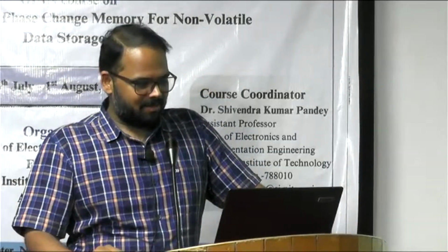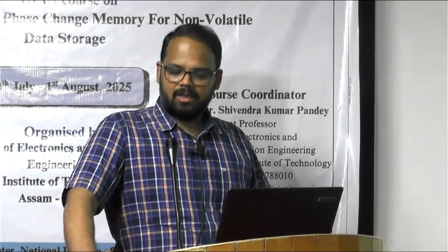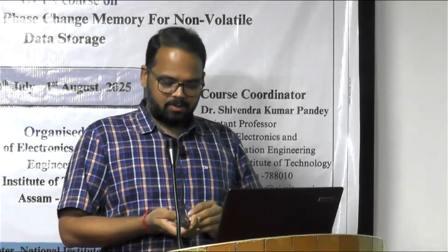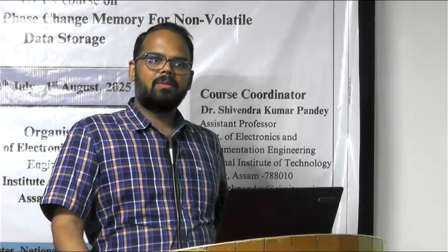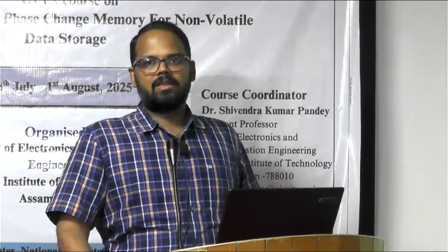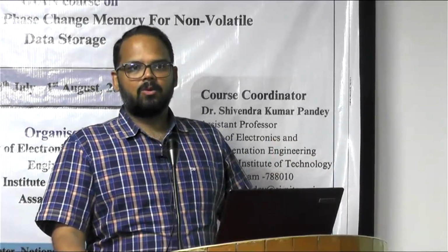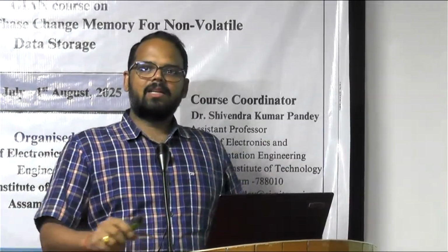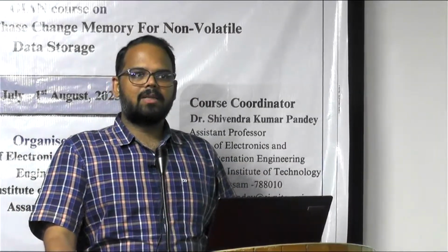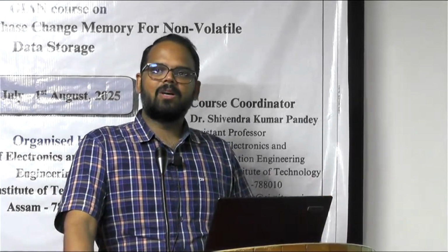So now we will go ahead with our next session. This is based on tutorial. In this tutorial, we are going to discuss thin film deposition, how you can make a thin film. First of all, what are the equipment currently which we have here. On that you can see that facility and how we can make the thin film based on these chalcogenide based devices. And if we want to take their resistivity measurement, how we can perform that. On the basis of these things, I will cover a few aspects.